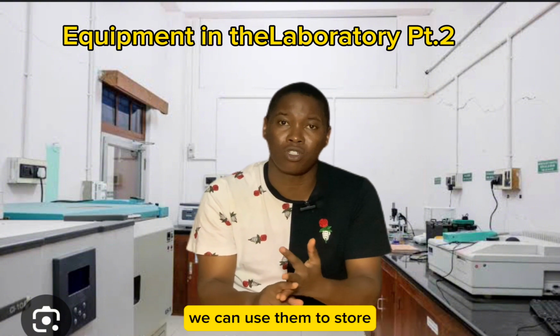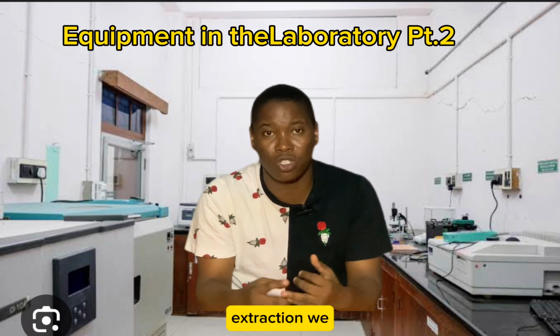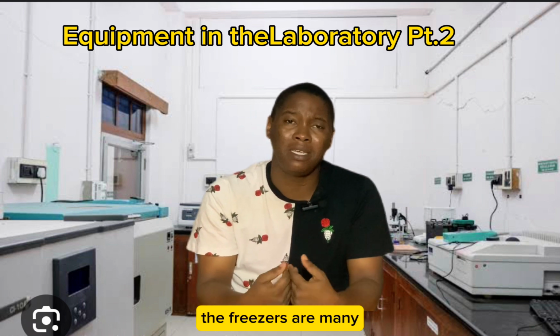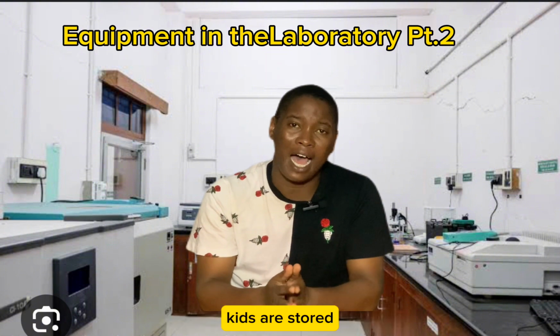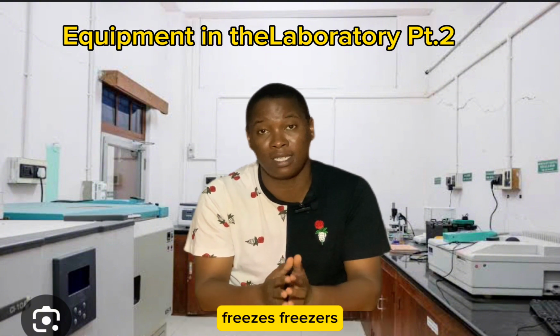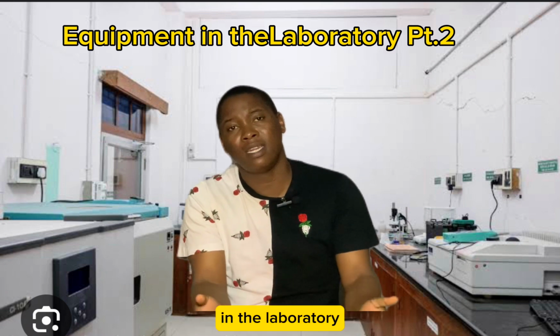We can use them to store some of our reagents, like reagents that we use for DNA extraction. We store them there. Our primers, we store them in the freezers. And many kits, assays, many different things that we do, kits, are stored in these freezers and fridges. So they are also important equipment that are used in the laboratory.